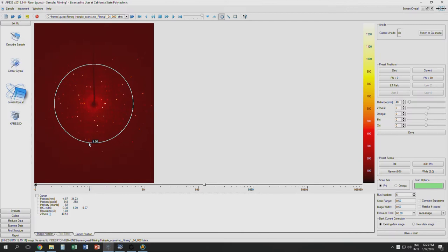The farthest out from the center that you see bright spots will define the limit of your resolution. Drag the circle cursor to this edge, and you will see a number.